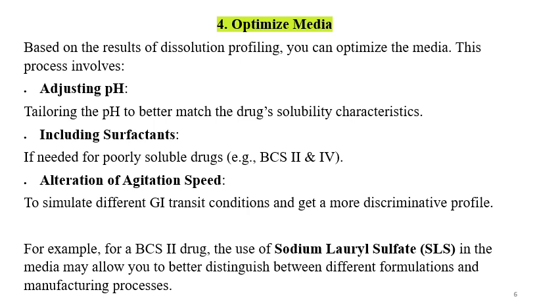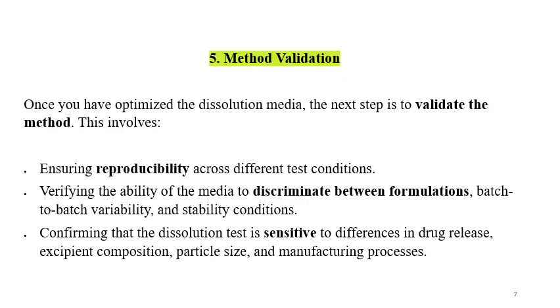Also consider the specification time points for having the discriminatory power. Fifth point is method validation. Once we optimize the dissolution media, the next step is to validate the method.